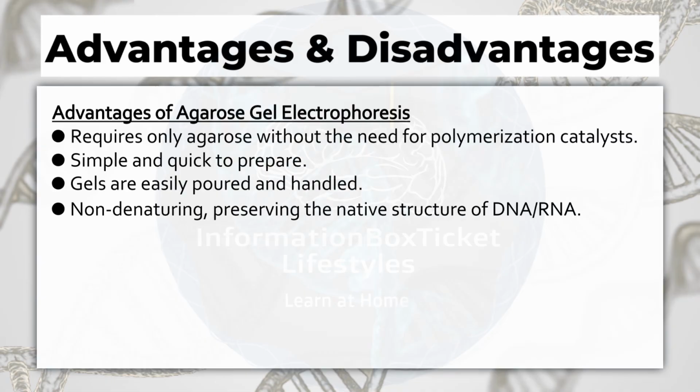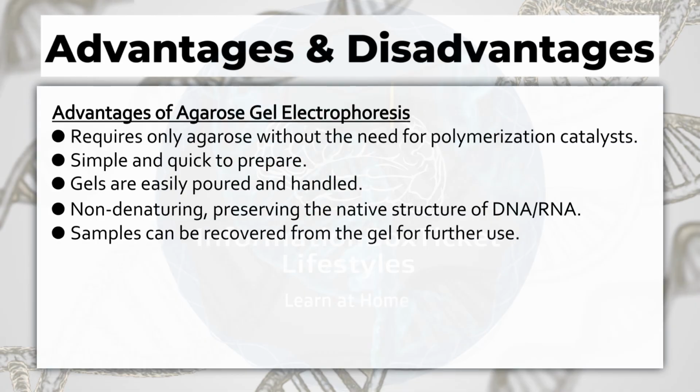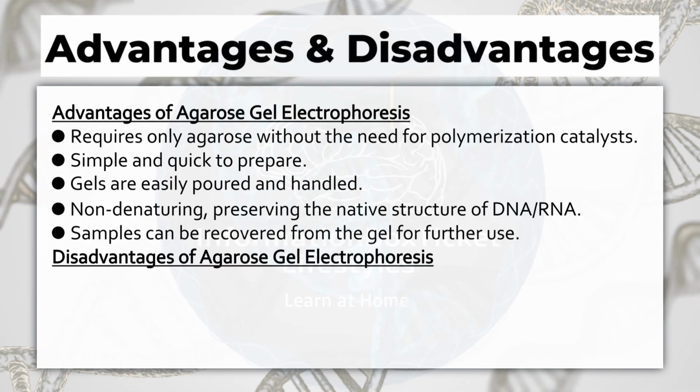Non-denaturing, preserving the native structure of DNA and RNA. Samples can be recovered from the gel for further use. Disadvantages of agarose gel electrophoresis.